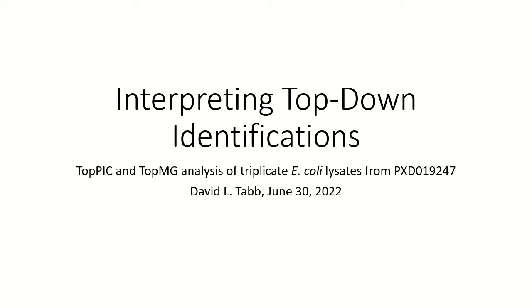Hello, I'm Dave Tabb, and today I'd like to walk you through how we interpret the search results that come from TopPIC Suite when we analyze data sets of shotgun proteoforms for top-down proteomics.